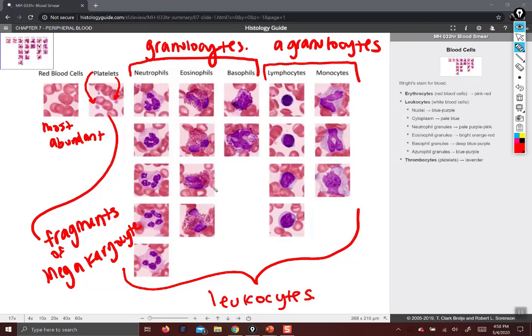Basophils are the rarest. They have dark blackish-purple cytoplasmic granules, and sometimes the granules are so densely packed that it's hard to see the nucleus, but they do have a nucleus with some lobes.